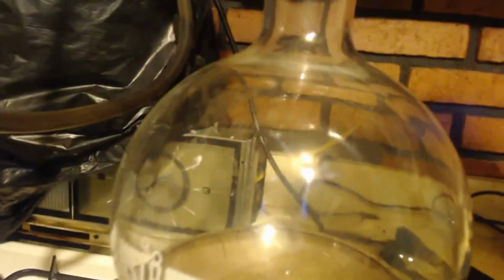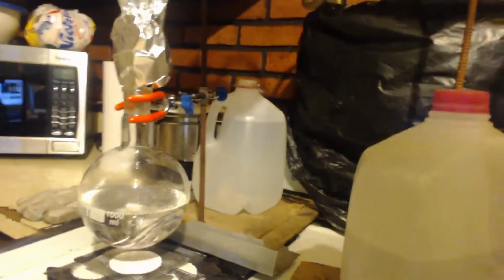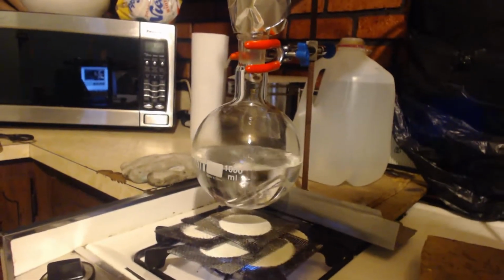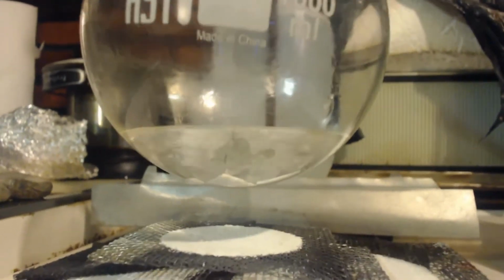So anyways, the reason why I used a big flask here is because I'm running out of flasks. Basically, the only ones I have are these two right now. Anyways, I want to finish this up, and we'll see what I got. Well, it took long enough. I left that much in. It's probably only 50 milliliters of water in there, but it's so low. I mean, there's probably 100 milliliters in there. Say half of it is alcohol, half of it's water.